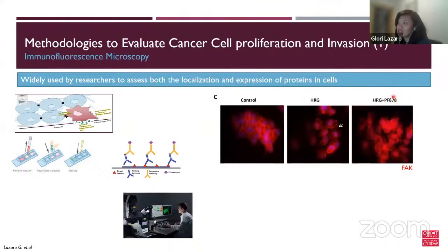And when you add this drug, you can see that it almost reversed that kind of process. So, dikit-dikit na naman sila, and they have this, let's say, kind of normal look. And so that's how you use immunofluorescence to understand how drugs work and how they affect the protein and cells. So that was good.